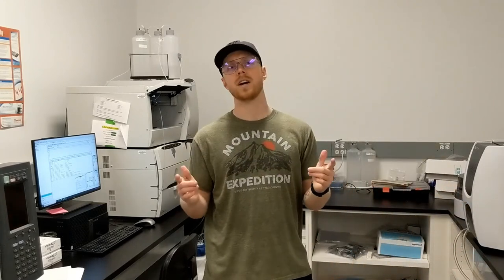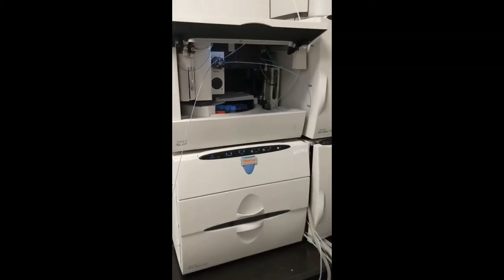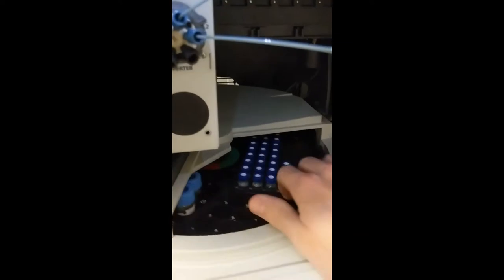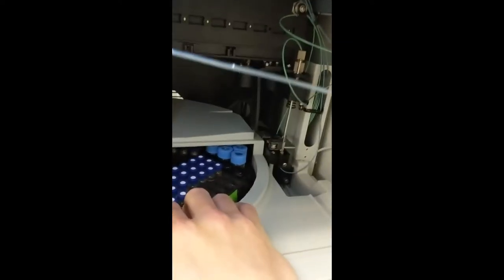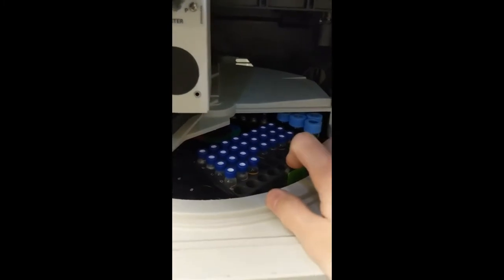Once you've got your calibration curve made, it's time to load the auto sampler. This right here is the auto sampler — let's take a look inside. You can see there are different trays that spin around, and the needle right here can pick from any of the samples in each tray.